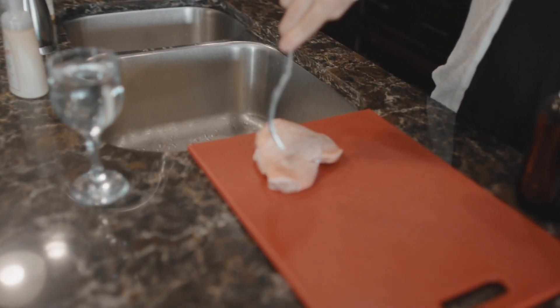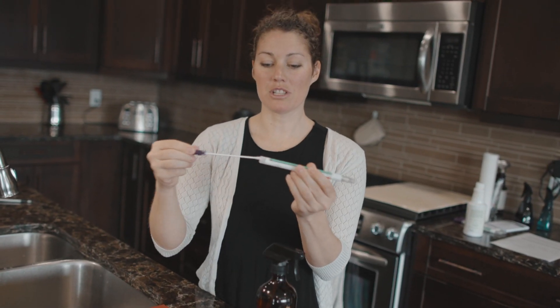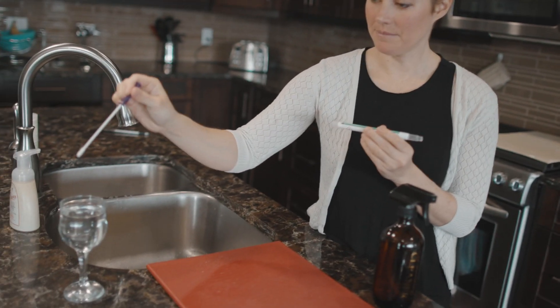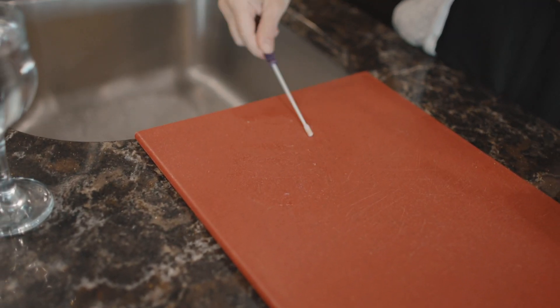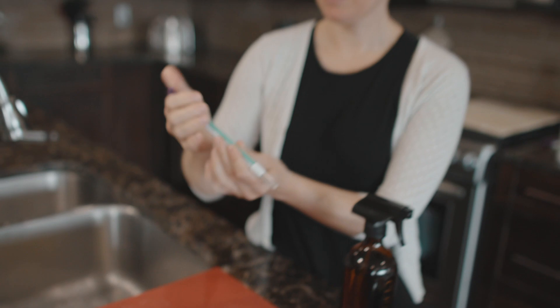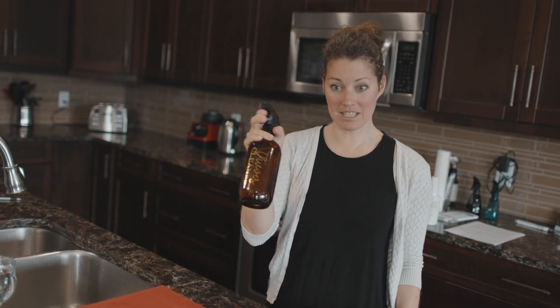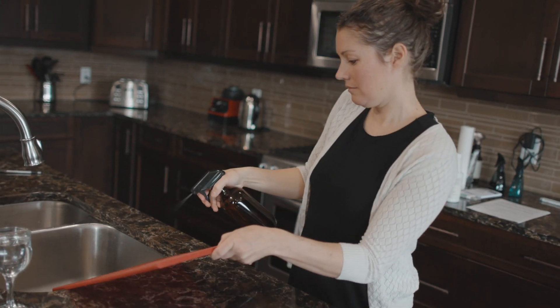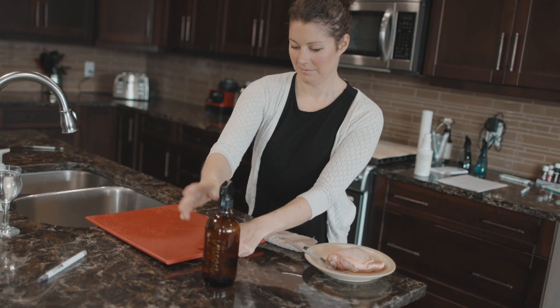The instructions tell me to moisten the swab with distilled water, rub it around, put it back in, and technically wait 10 minutes. Now let's take our Thieves cleaner.